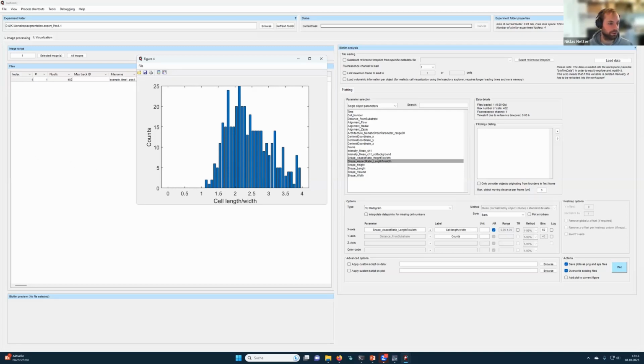Okay, there's a question in the chat that I will read. How is the measurement of convexity affected by the segmentation approach? I am asking because StarDist assumes that objects to detect are convex. Therefore, I would expect the measurement to be biased. Have you compared the range of convexity estimated from the same sample but segmented with different methods? Okay.